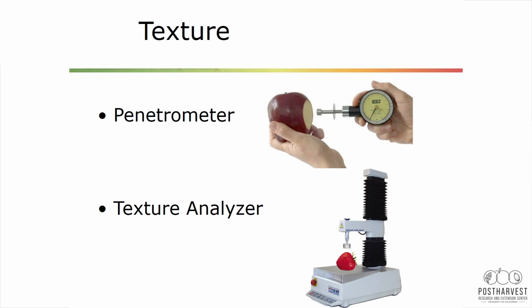Okay, and there are more expensive machines that have all sorts of capabilities, not only these flathead probes, but shearing and all kinds of really exquisite ways that you can mimic the bite of a human being. So that's kind of cool.